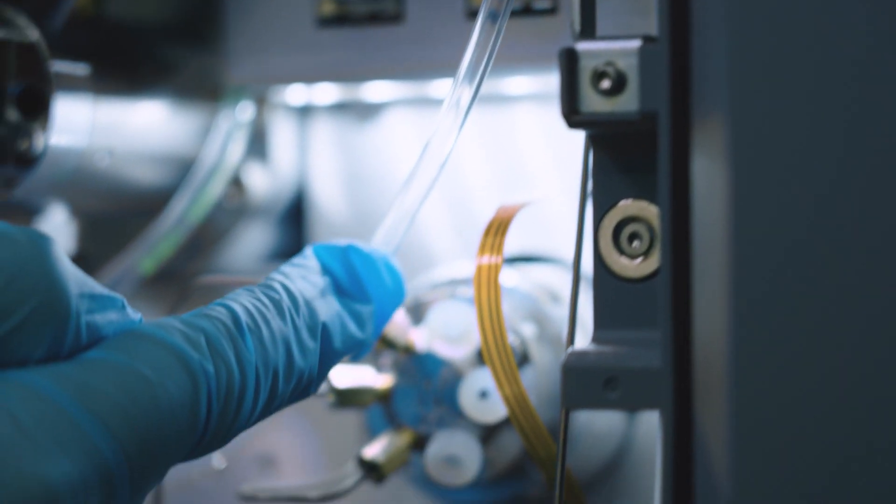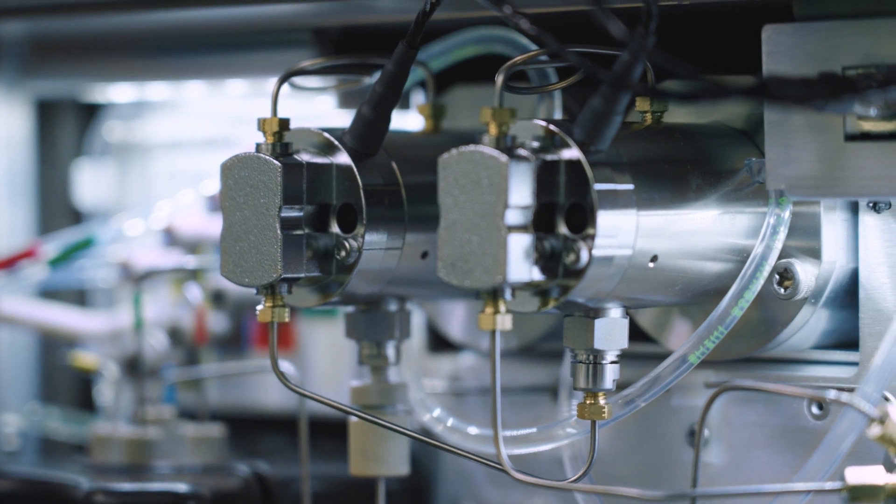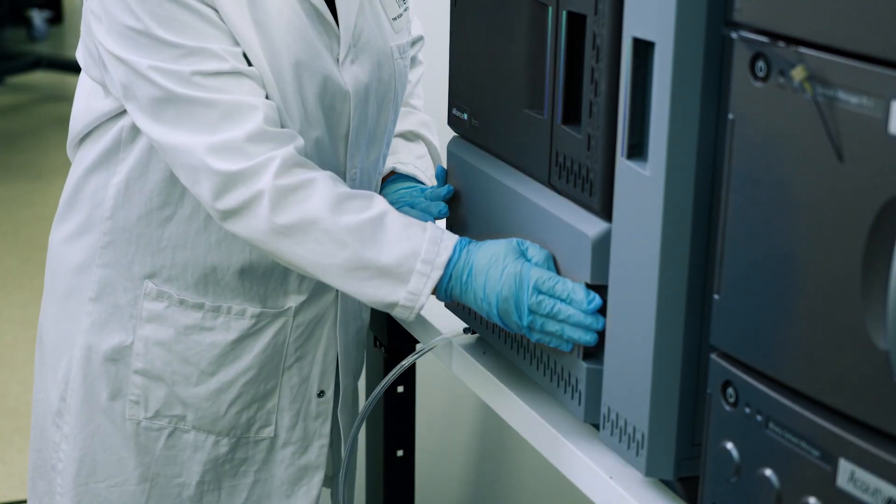The seal wash is important to ensure that the pump seals remain lubricated and free of debris, which in turn means increased system uptime. The seal wash pump is self-priming, meaning no additional user interaction is required to ensure that the seal wash is working.